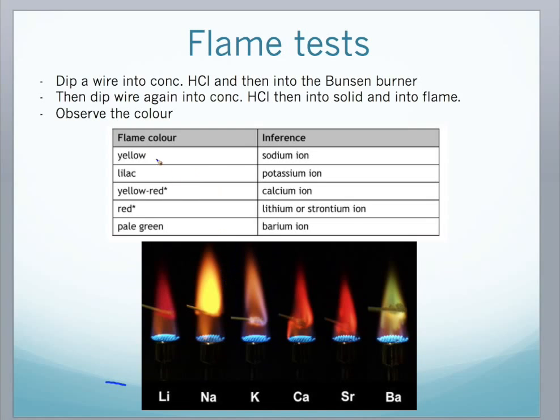And in the table above here, you can see the corresponding colors. This table is taken from Edexcel. So, for example, for sodium, it's a yellow flame. For potassium, it will be lilac, which is represented here.